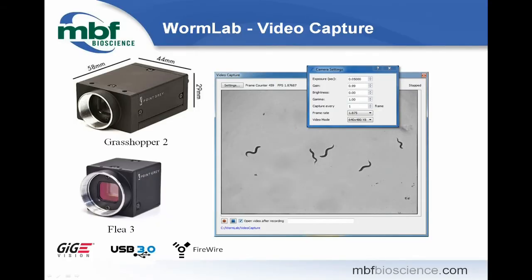All right, so what you saw during this demonstration was we imported some videos. So if you have videos in your lab, you can import them into Wormlab. We have an option where you can actually capture the videos with Wormlab using our camera interface. That's the screen you're sort of seeing at the right here.